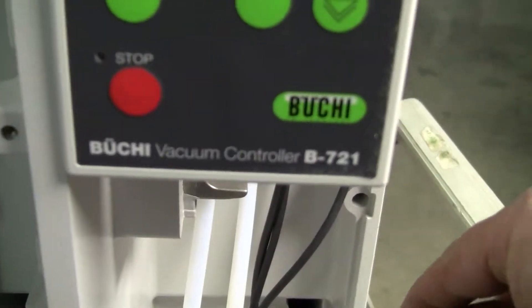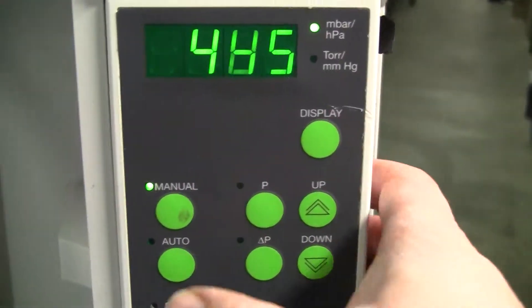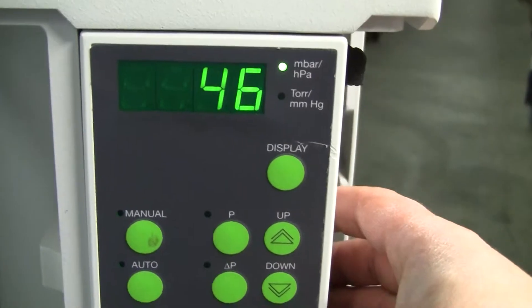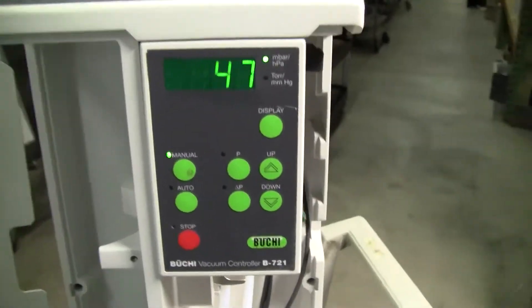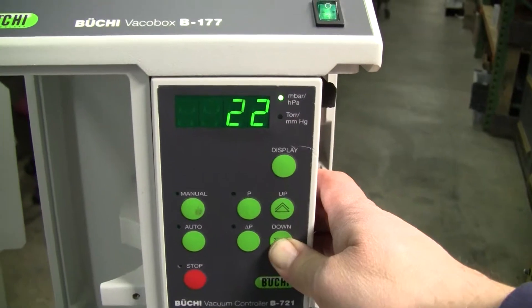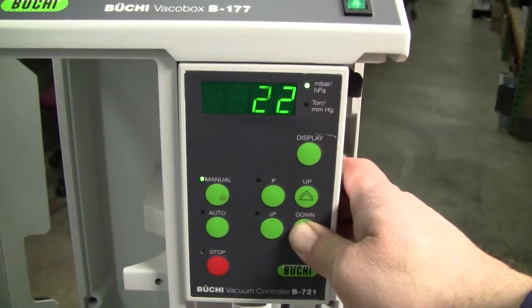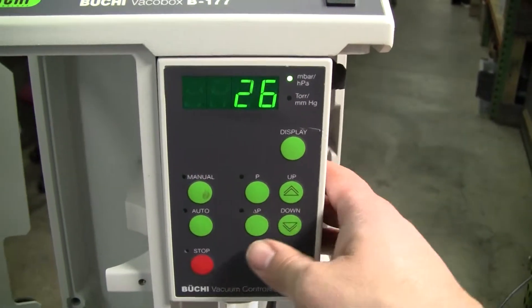The pump's obviously turned on. I'll put a load on the system now. Let's do manual. Let's drive this down to 47 millibar, even lower. That's where we're going.